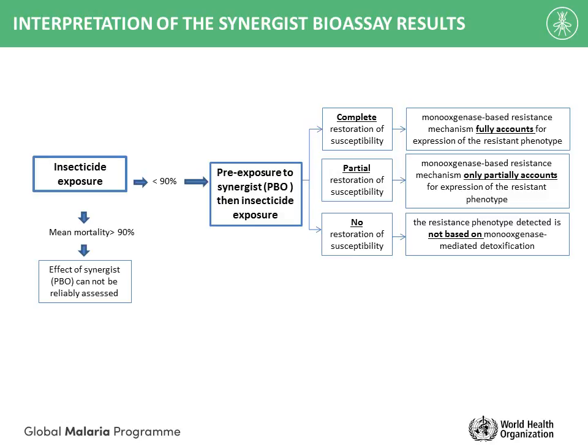The interpretation of these results could be a complete restoration of susceptibility, which means that the monooxygenase-based resistance mechanisms fully account for expression of the resistant phenotype. Partial restoration means that another mechanism may be present, and no restoration means that the resistance detected is not based on monooxygenase mediated detoxification.